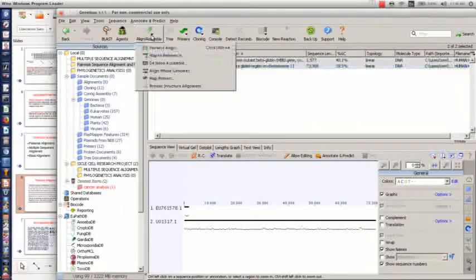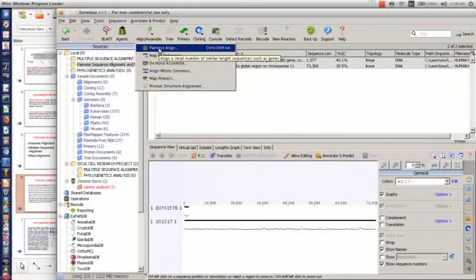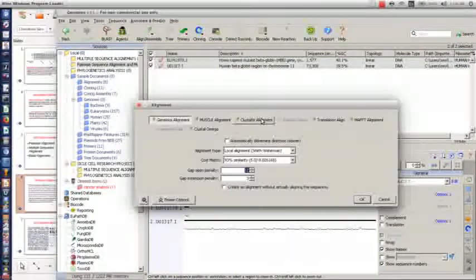So all you need to do right now is go to Align and Assemble. So you pick Pairwise Alignment. Before, it was multiple sequence alignment. You're going to see multiple sequence alignment in this place because that's the option the Geneious software is going to provide, because it was already recognized that you're working with multiple sequences. But here the software recognized that we're working with this sequence, so we brought Pairwise sequence alignment. So you click and then you find this.